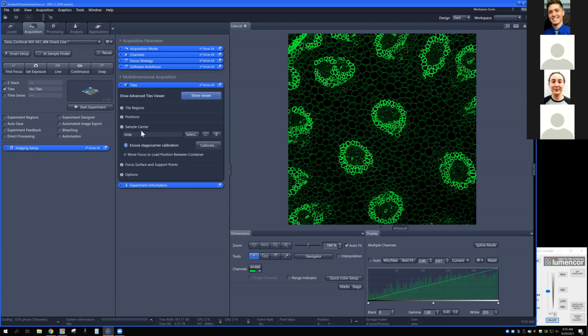And honestly, we're going to see how we do for time, because an hour might not be enough time to cover everything. If it is not, then we might take the spectral portion that we planned from 2 to 3 today and just do a little bit more tiling and positions. So just fair warning that you might have to stick around for the afternoon if this is the only thing you wanted to see.